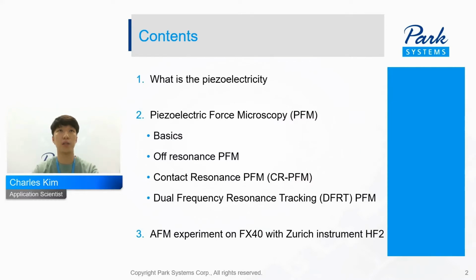Here is the content. First, we're going to see what piezoelectricity is. And second, we will talk about piezoelectric force microscopy. There will be the basics to know what PFM is, and after that I will introduce three different PFM modes. The first one is the off resonance PFM.